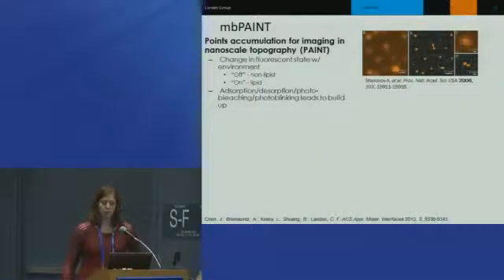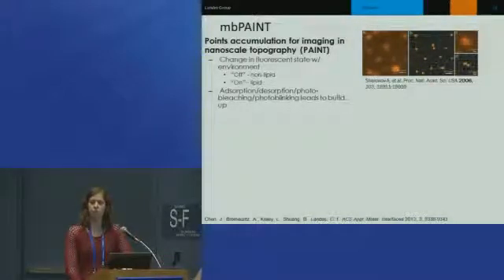And then how do we resolve anything on the order of the size of a protein? Starting about in 2006, maybe 5 different groups on the planet came up with different ways to do super resolution microscopy, which is to image below the diffraction limit of light. There's not really time to tell you about the other methods, which include lots of different acronyms like STED and PALM and STORM and RESOLFT and SMACM.